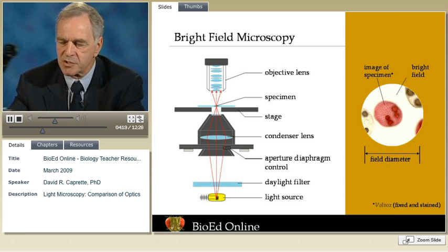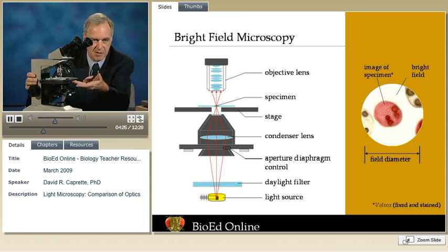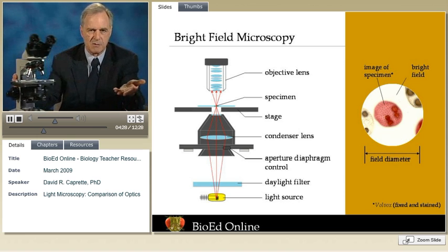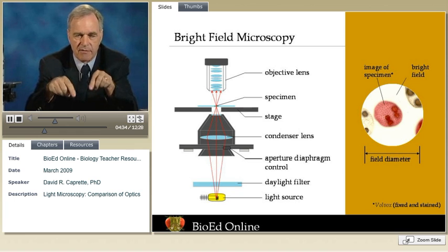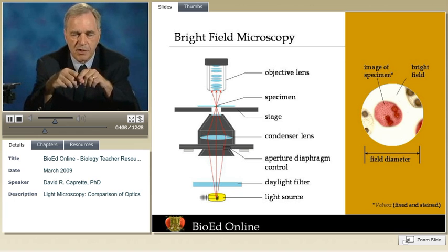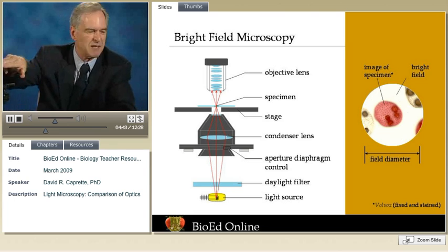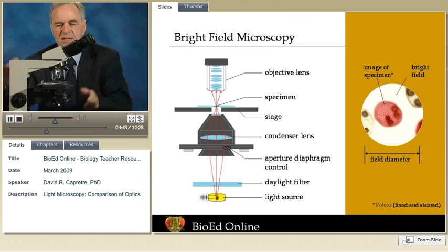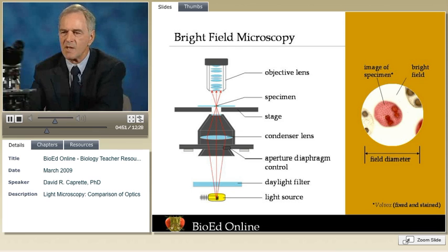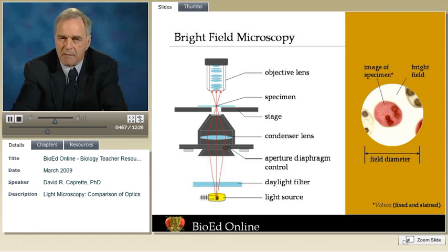In the bright field microscope, the light comes up into the condenser. It comes up through the stage into the specimen. It's transmitted through the specimen, which then absorbs some of the light, producing a contrast. And from there, the light from the specimen enters the objective lens into the aperture. It's magnified. The magnified image is projected upon the back of the objective lens. And then the light follows a path, sometimes through a prism, as in the case of this binocular microscope, into the eyepieces. The eyepieces, in turn, magnify the image some set amount, usually tenfold, and we see a nice high-resolution image.